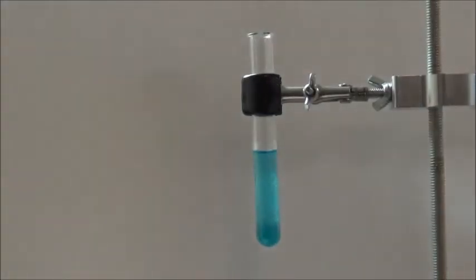I will now drip the sodium sulfide solution slowly into the test tube. You can immediately see a dark precipitate of copper sulfide.